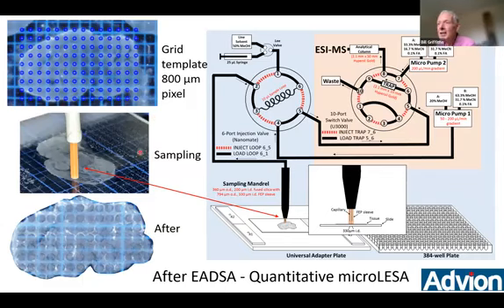So the LESA, as I said, is a liquid extraction for surface analysis. Basically we have a robotic probe that goes down onto the tissue, and we have solvent in the robotic probe which extracts the sterols. The sterols are then extracted, and we come up here. The probe is then connected to an LC. The extracted sterols go through this rather convoluted plumbing system, and first the sterols are trapped on a C18 trap column, and we wash away the Girard reagent.